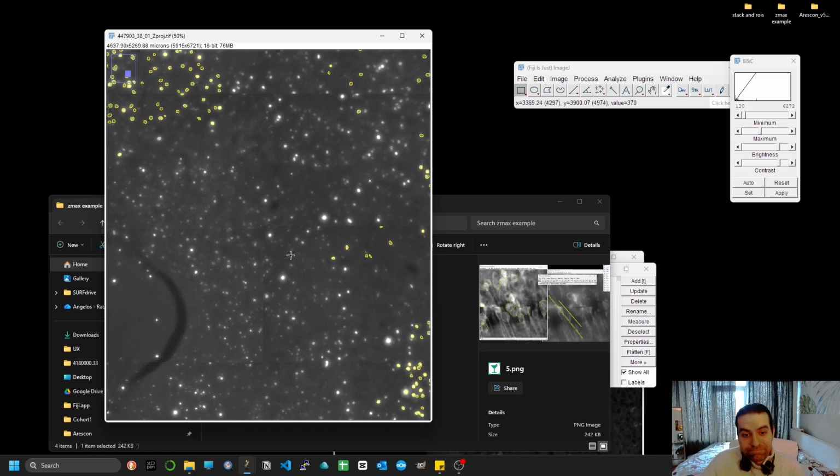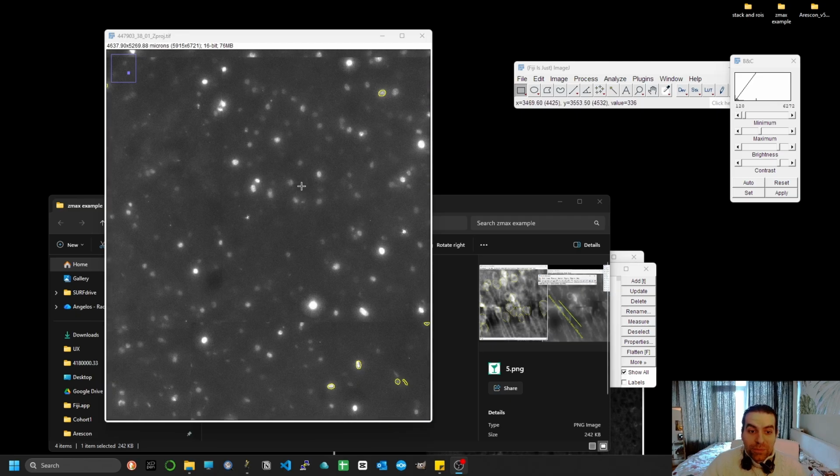However, the problem with that option is that the contours of the predicted cells become less reliable the looser your criteria become, and especially if you're looking for overlaps, this is going to make it trickier. Also, you cannot reliably filter a cell based on the surrounding mean background, because that background is now also sort of artificial.